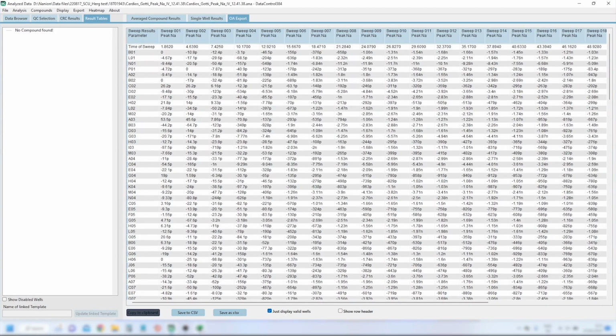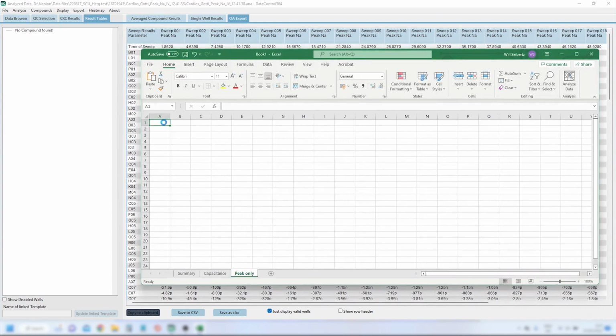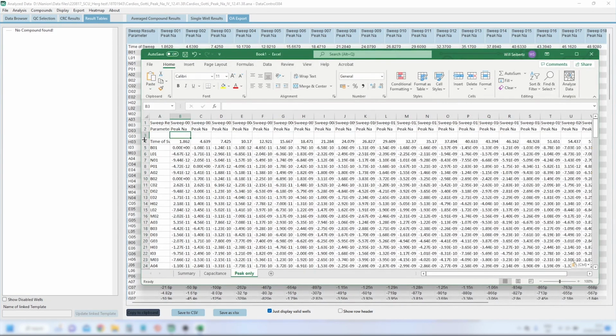Here, only the peak current results are pasted into the workbook. It is recommended to always report electrophysiological currents as current density. This requires the peak current with the unit amps to be divided by the capacitance with the unit farads. This can be done easily in Excel.